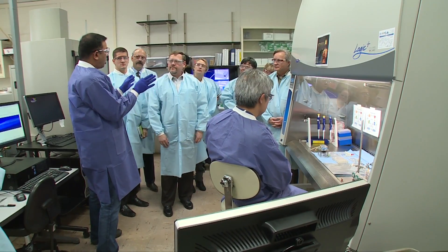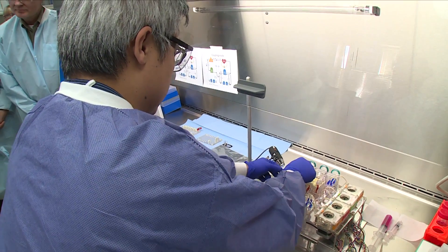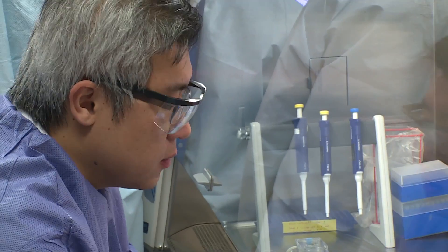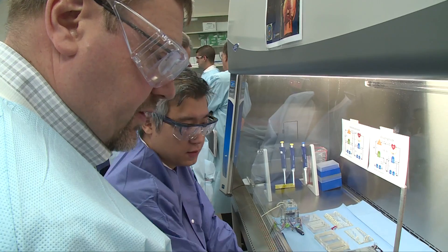Athena is a full organ bioreactor — liver, heart, lung, and kidney. They are designed to simulate either the architecture of the organ system or the function of the organ system. The four organ systems are integrated by a common universal media, what we call blood surrogate.